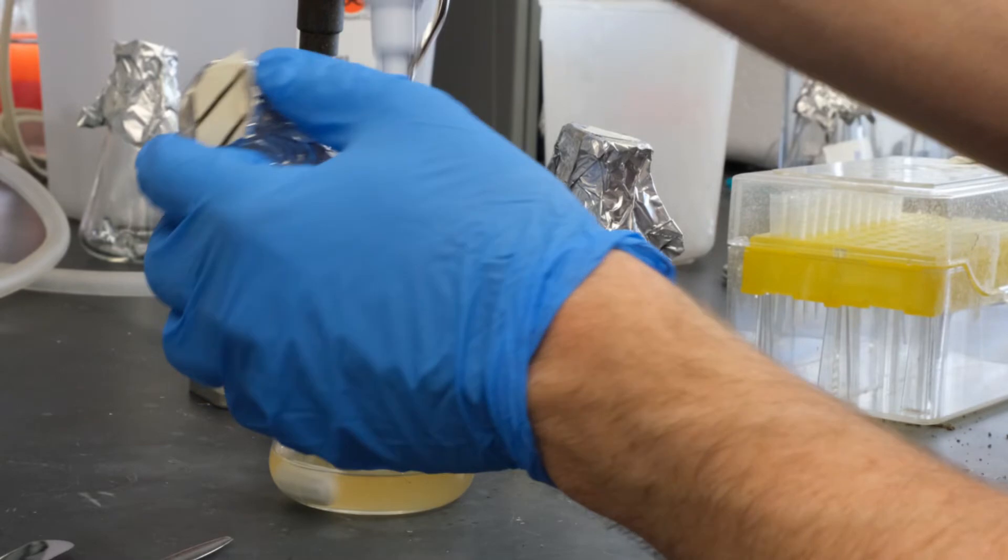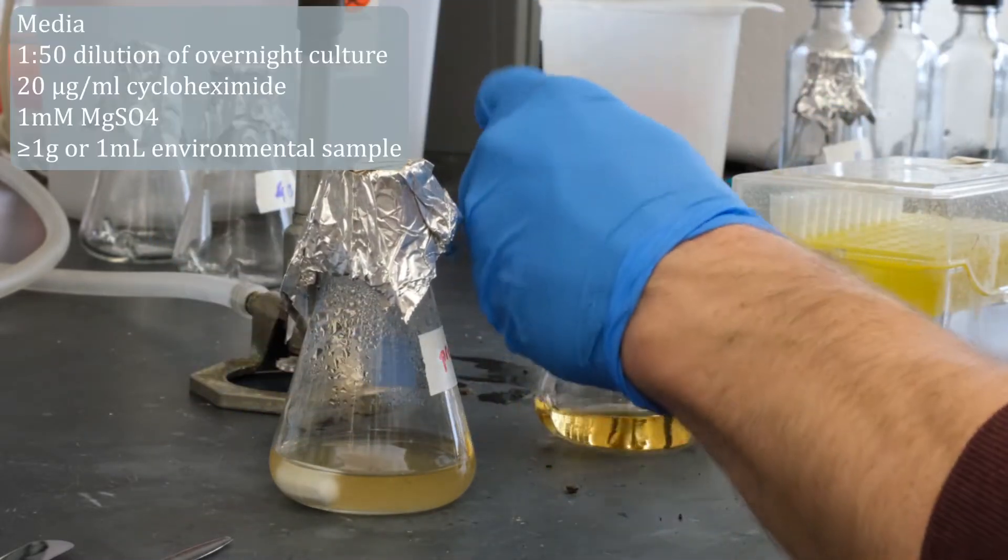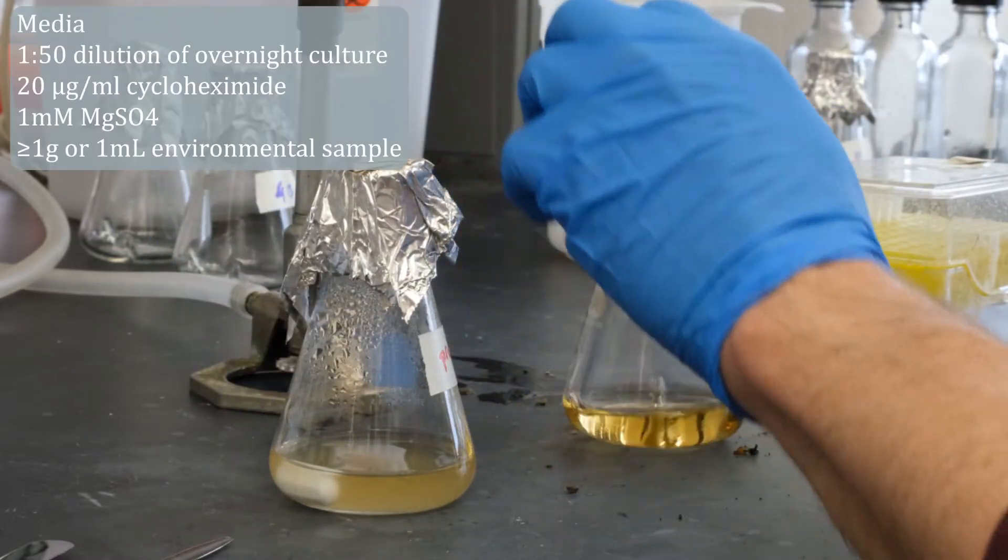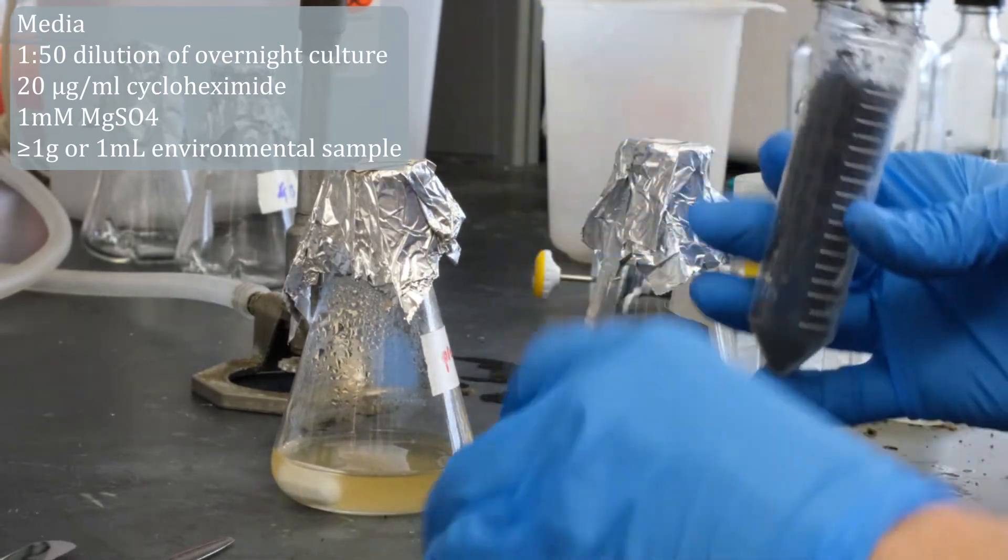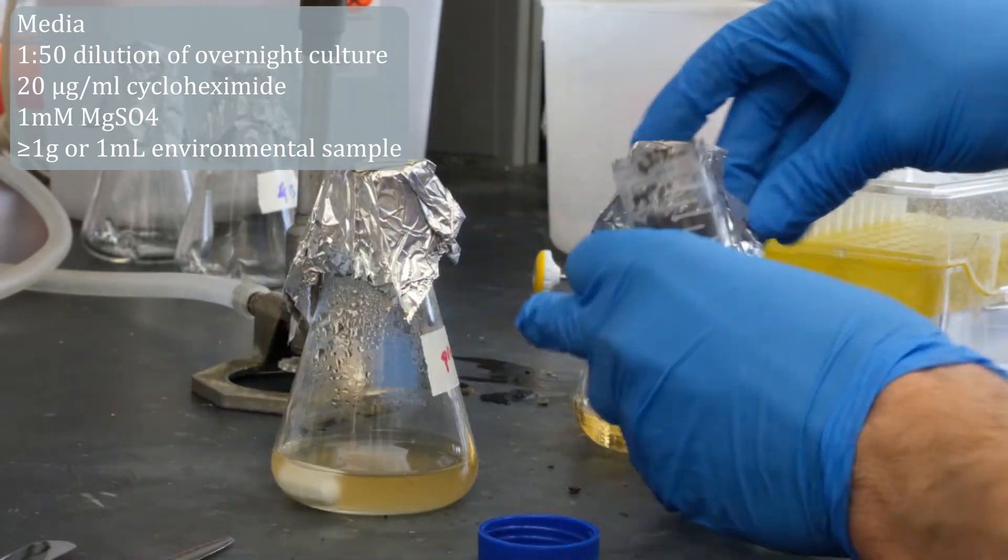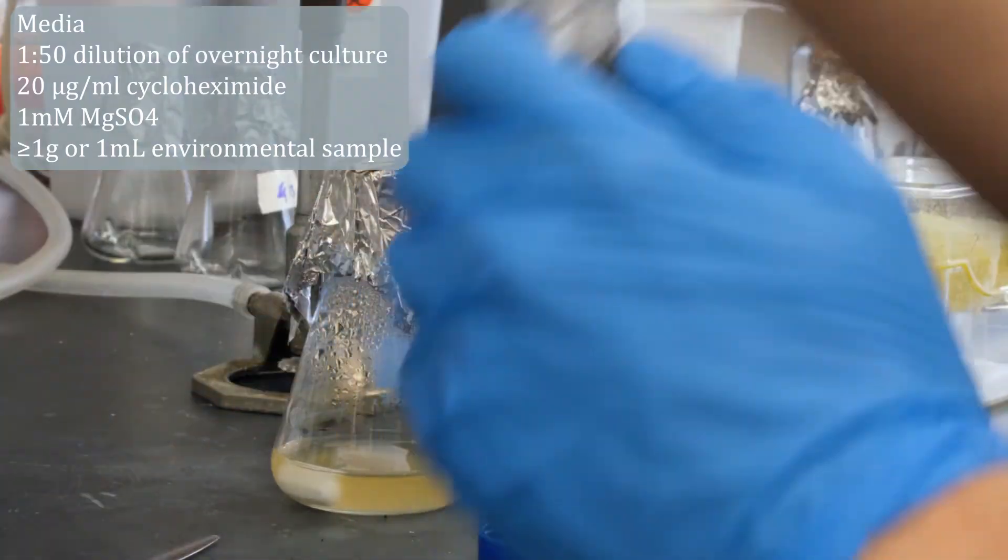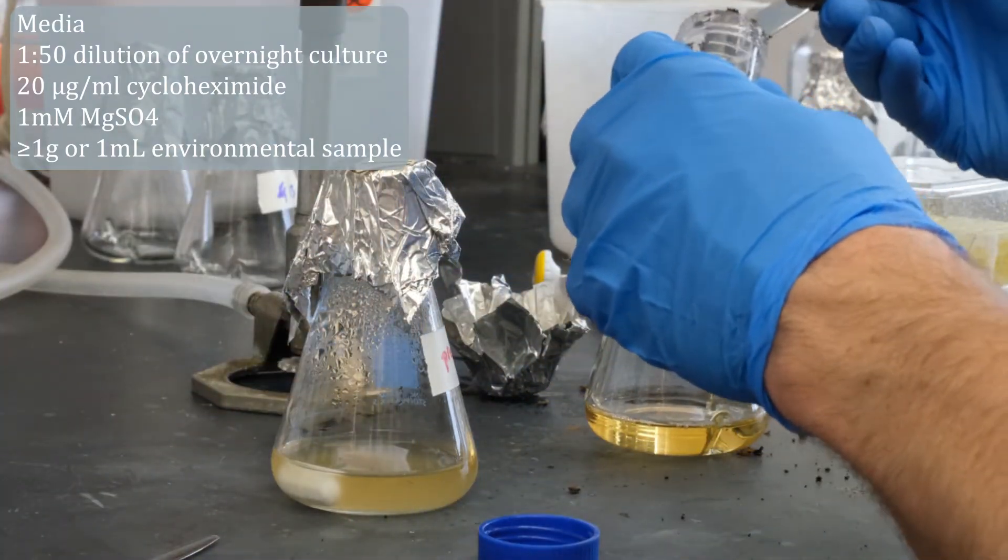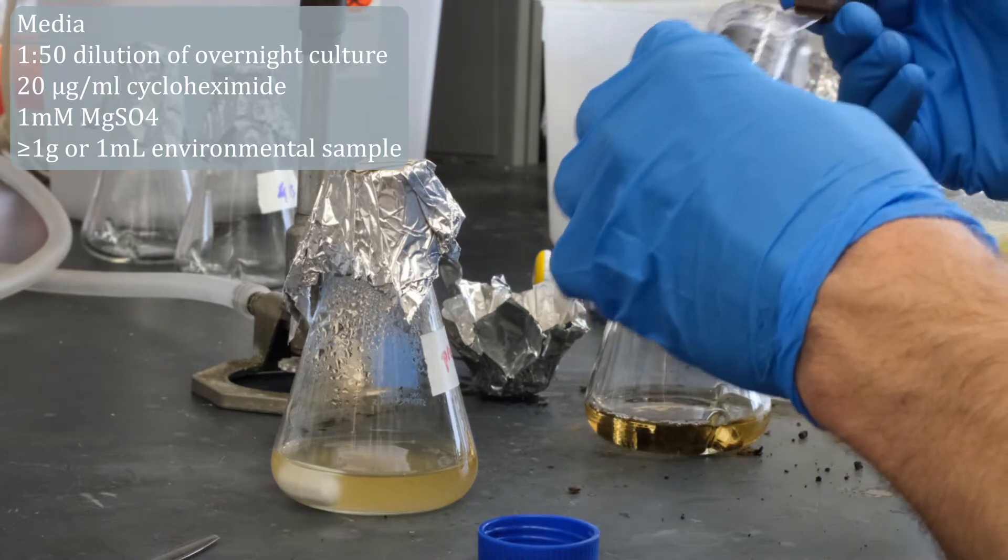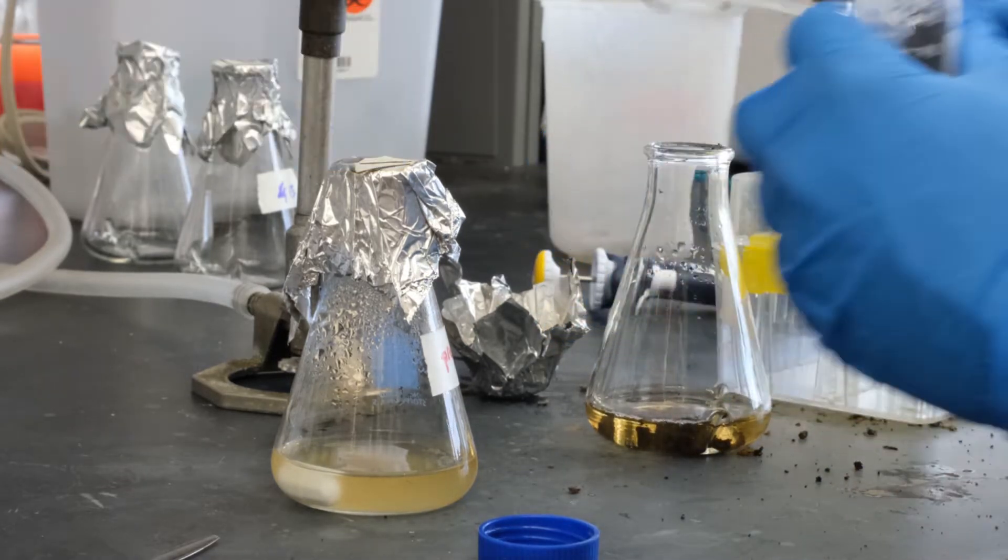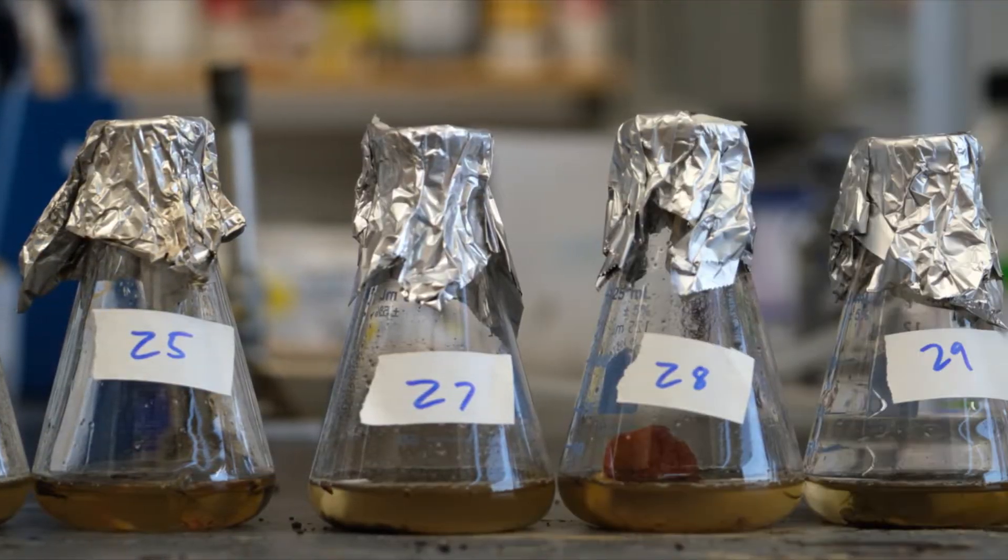Set up an enrichment culture for each environmental sample that you collected. In a new flask with new media, add overnight culture, cyclohexamide, magnesium sulfate, and at least one gram or one mil of the phage sample. Grow it overnight as you would a bacterial culture. You want to grow up a dense culture of the host bacteria, which any phages in your sample can infect and multiply in.